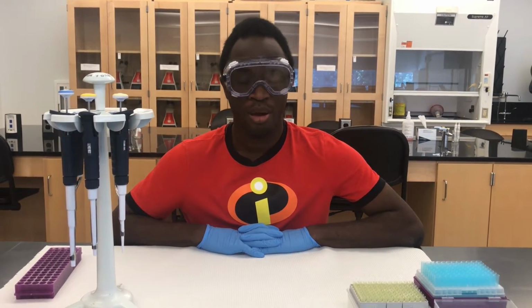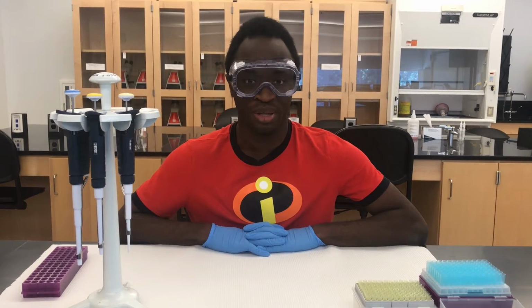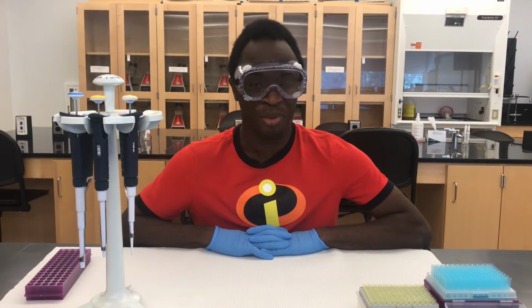In this video, you will learn how to set and use a micropipette. Micropipettes are used to transfer small volumes of liquid, usually less than 1 milliliter. Keep in mind, 1 milliliter equals 1,000 microliters. The scale of micropipettes is set for microliters.